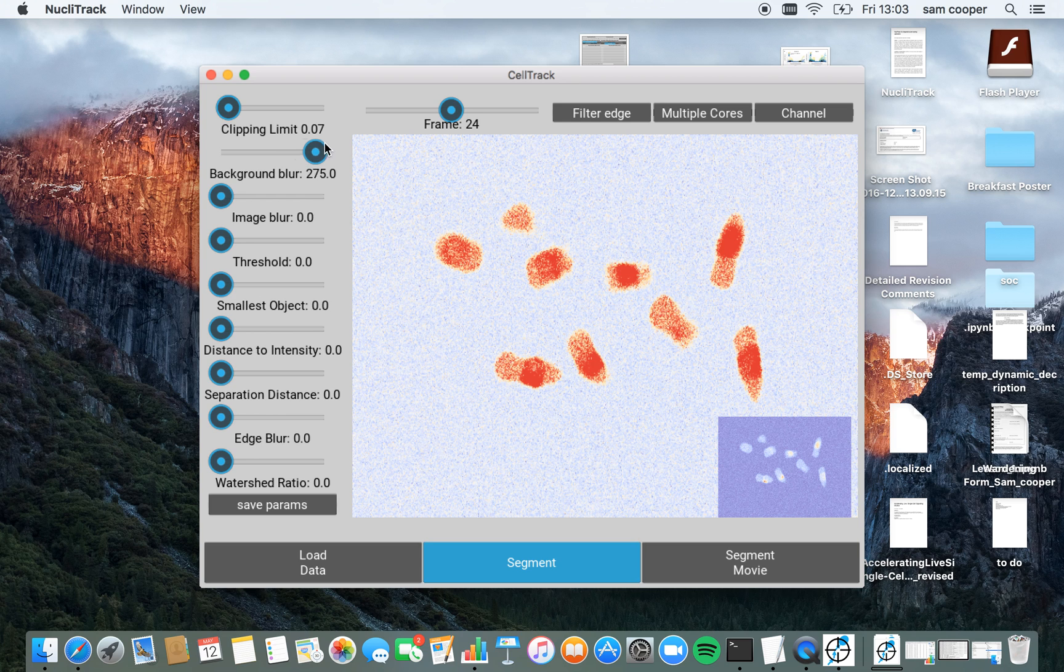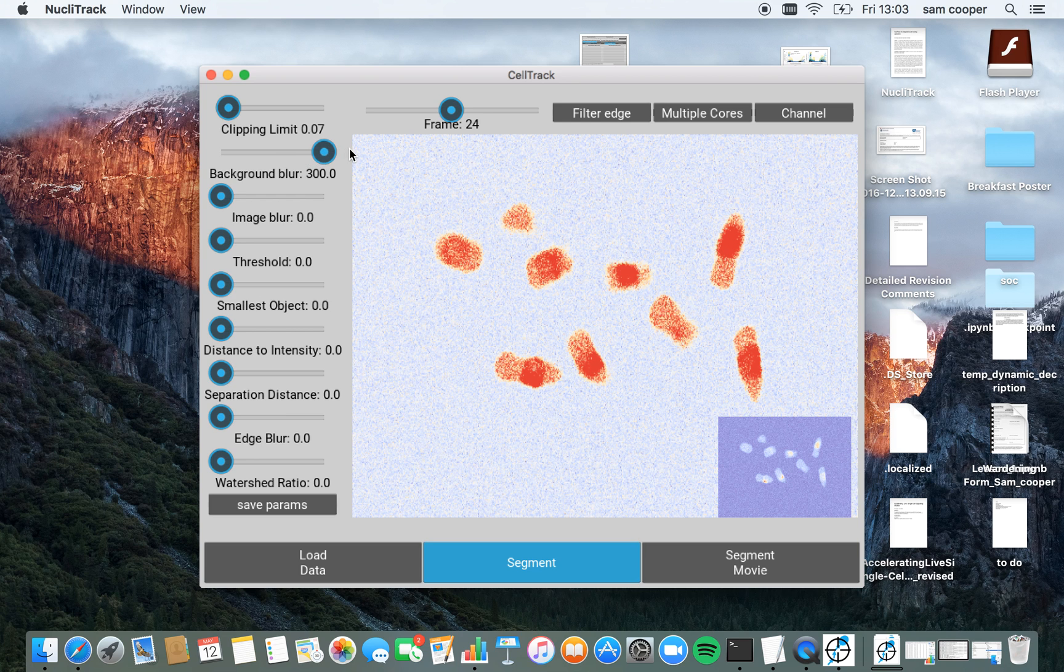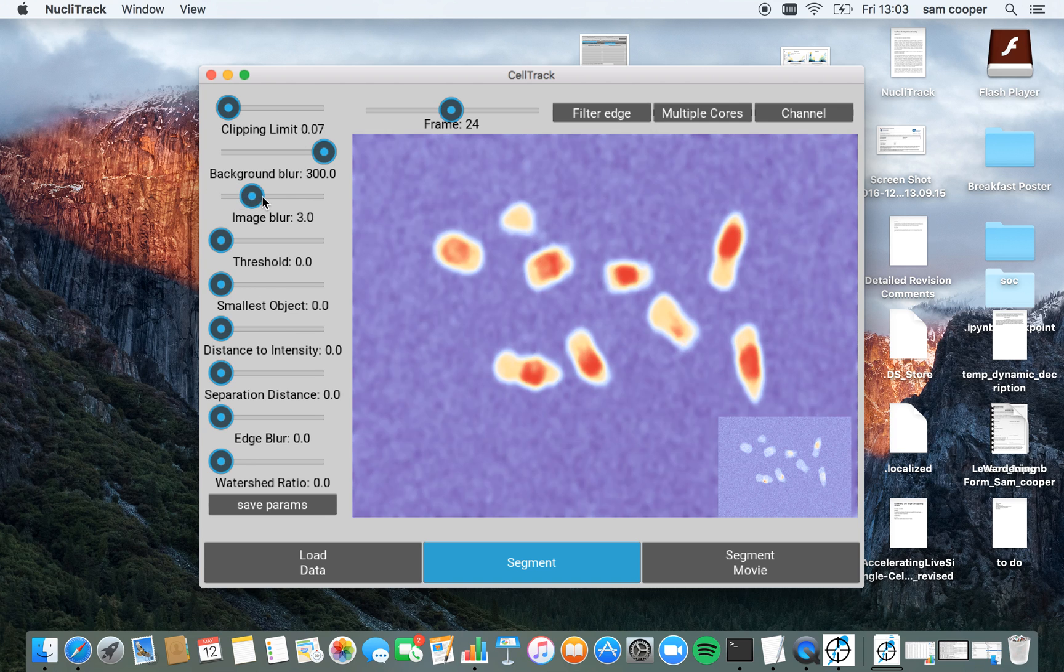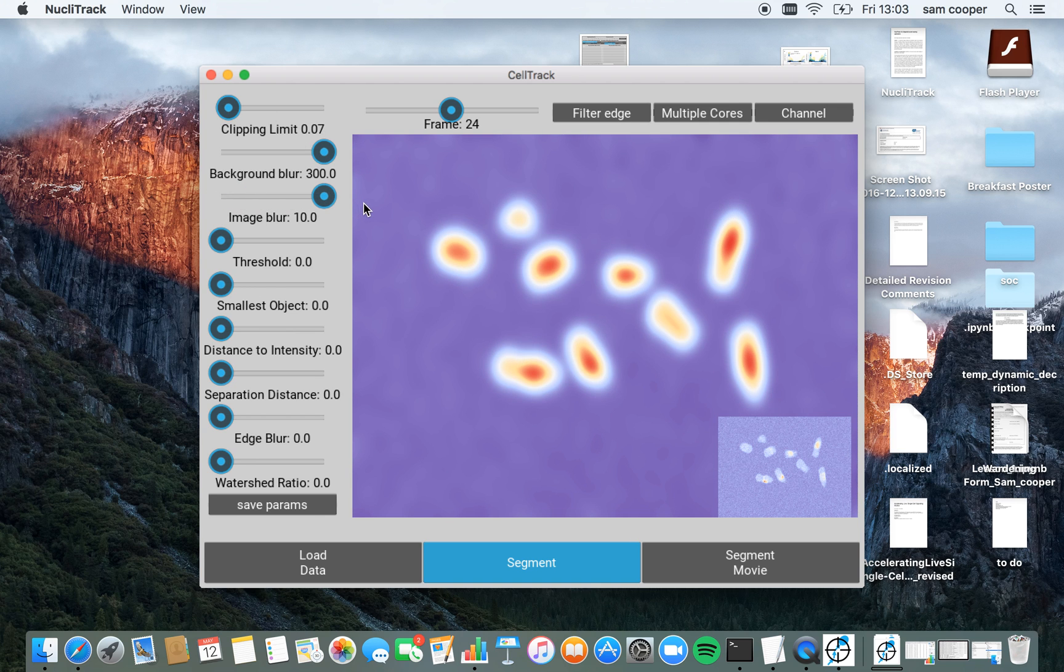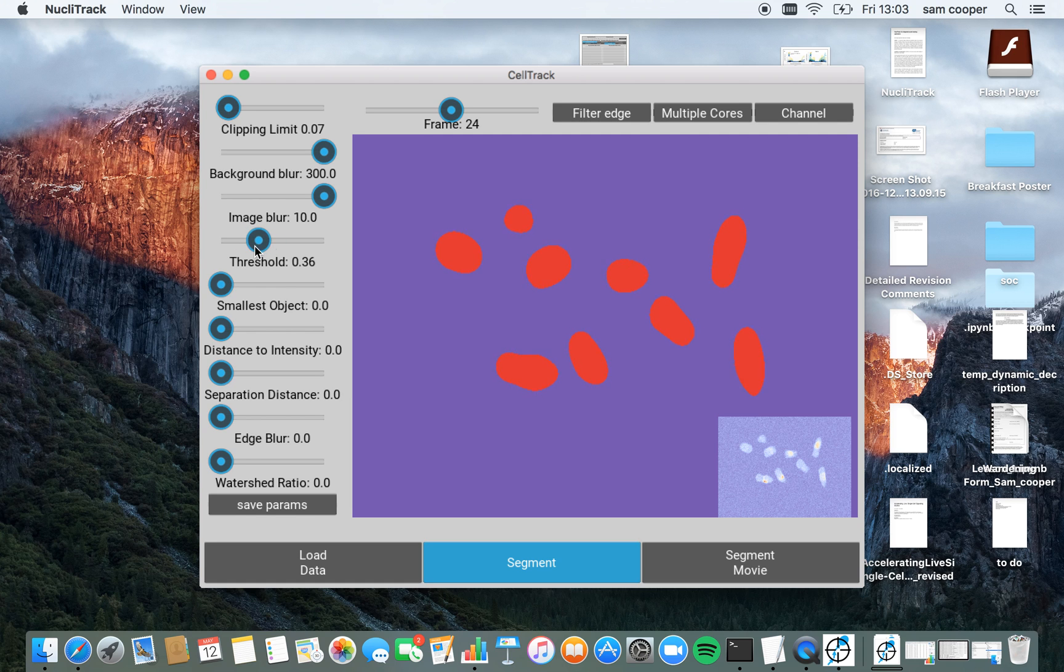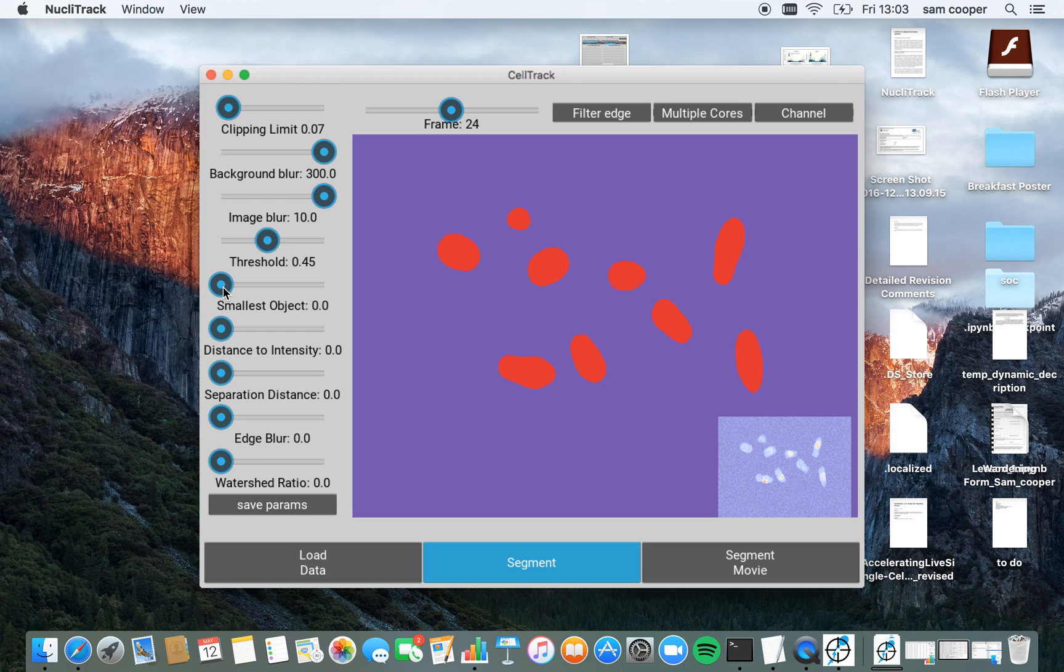I'm then going to remove any background intensity variation by using this background blur slider here, before blurring the images to highlight where the center of each nuclei is. This threshold operation then selects a sensible size or basically identifies where these nuclei are, whilst the smallest object filters out noise from this thresholded image.